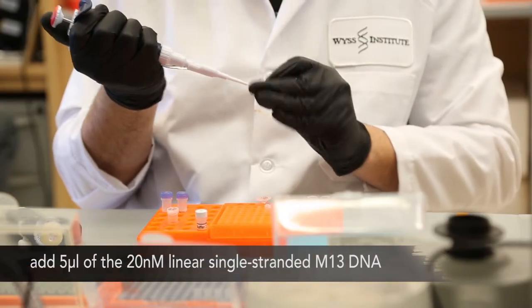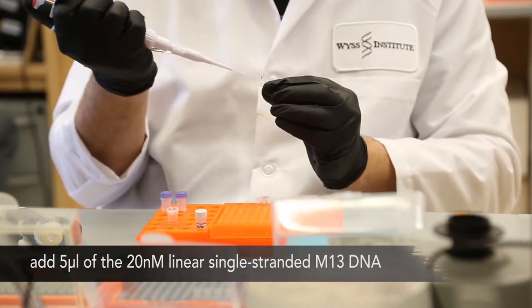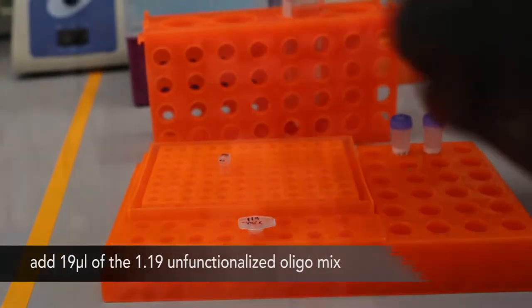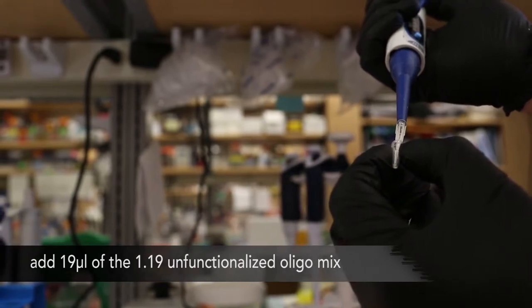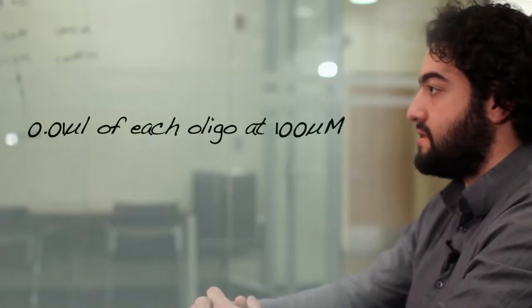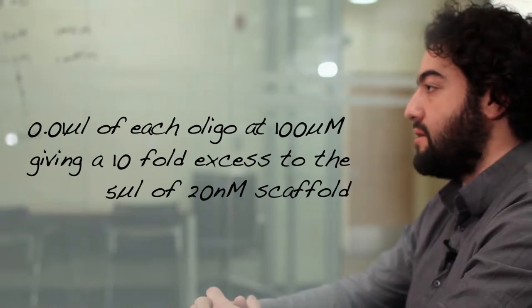Mix the single-stranded scaffold, unfunctionalized oligonucleotides, and functionalized oligonucleotides in a PCR tube as follows. We will add 5 microliters of the 20 nanomolar linear single-stranded M13 DNA we made in video 1. To this, add 1.19 microliters of the mixture of the 119 unfunctionalized oligonucleotides. This is essentially like adding 0.01 microliters of each of the oligos at 100 micromolar, giving a tenfold excess to the 5 microliters of 20 nanomolar scaffold.